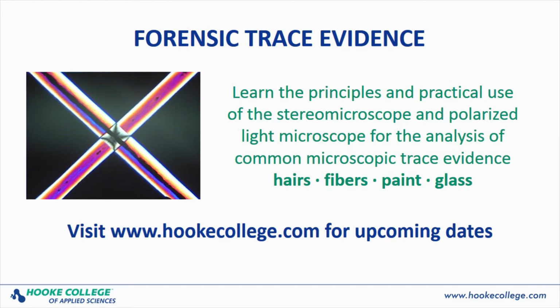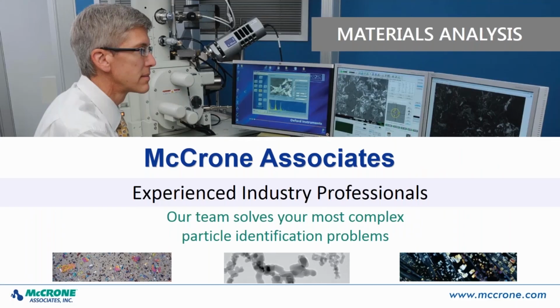This one's from Mike. What's the difference between dispersion staining and Rheinberg illumination if they are both optical staining methods? Yeah, with Rheinberg illumination, you use what's called a central stop, or a disc of one color surrounded by what's called an annular stop, or a donut-shaped disc of a different color, to provide contrast.